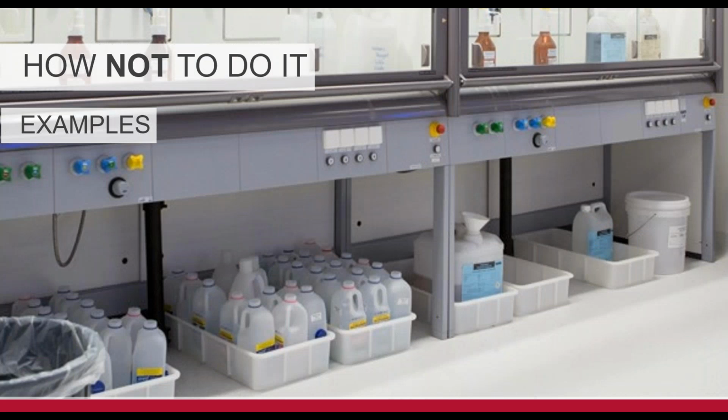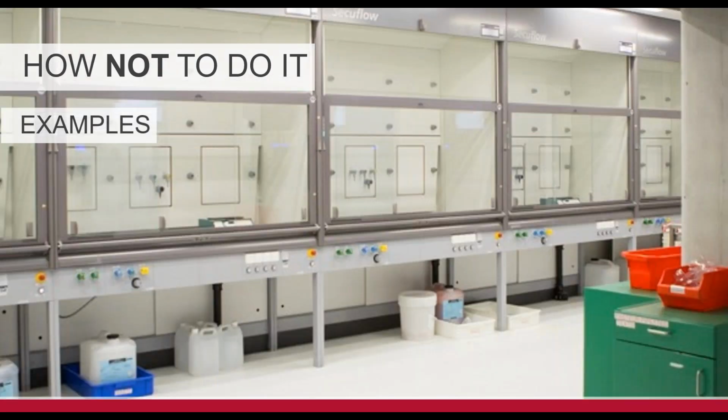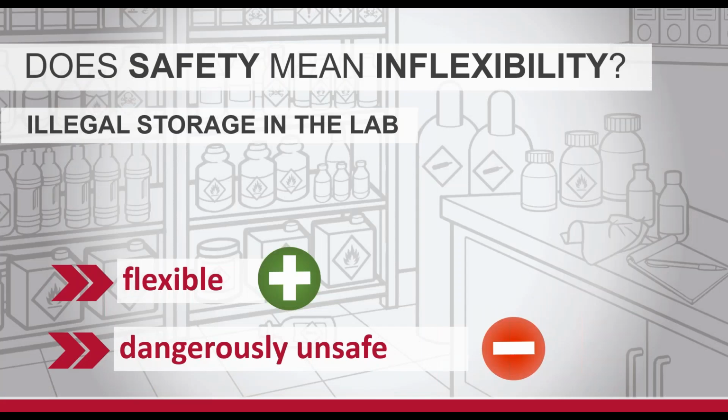Again, other ways, got to pay attention to the waste. Got to pay attention to the waste, not just the internal side. Does having places to store inside the space mean inflexibility or any of that stuff? It allows them a quick means to the product, but it does not create a safe environment. There's all kinds of flammables stored when we don't provide the right solutions on the inside.